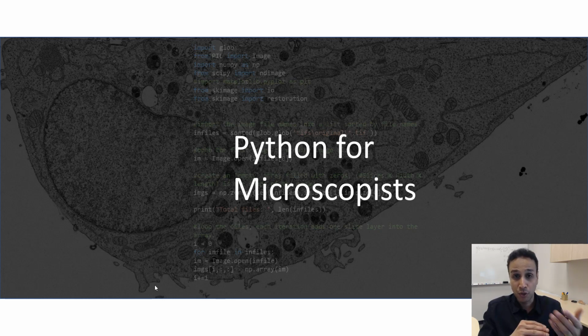Sometimes it's worse. So how do we clean those images up? This is exactly what we're going to look at in today's tutorial.